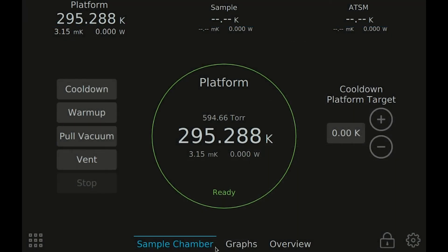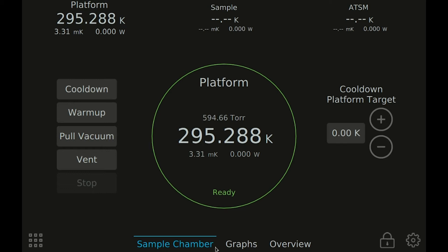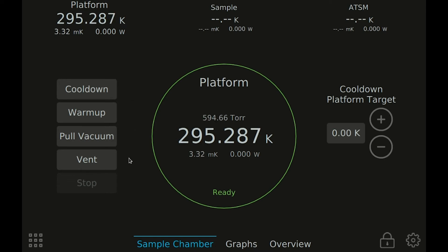When you turn on the system, it always starts in the main operate view for the sample chamber. The main operate view is the primary place to operate and control your system. The main functions in your system will be found here, like cooling down, warming up, pulling vacuum, and venting to exchange samples.